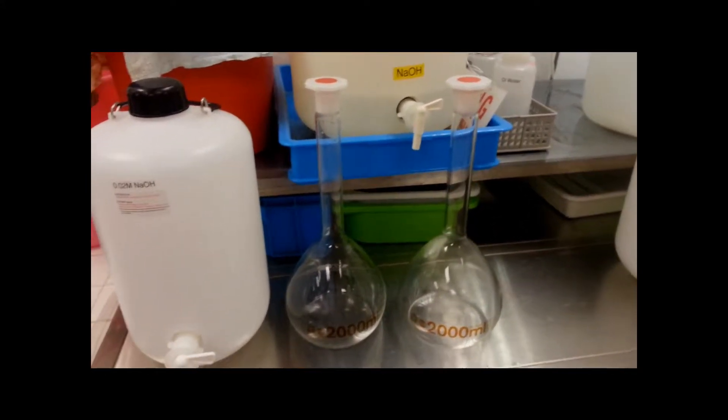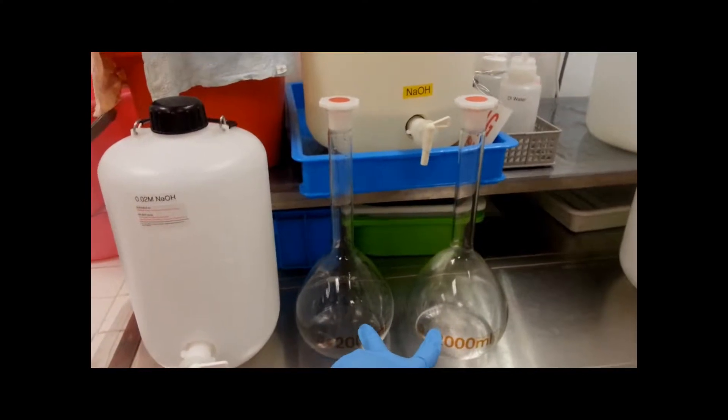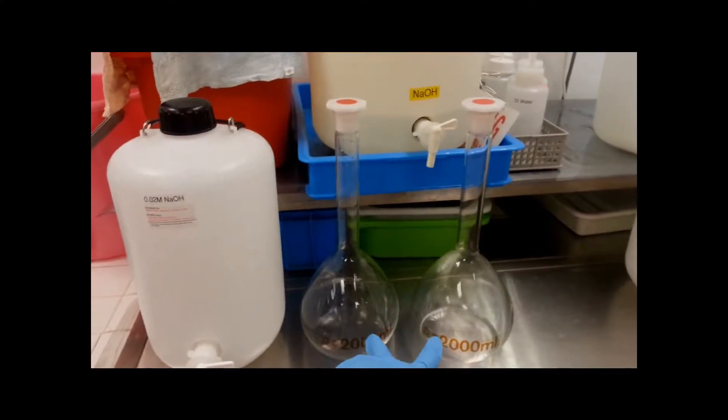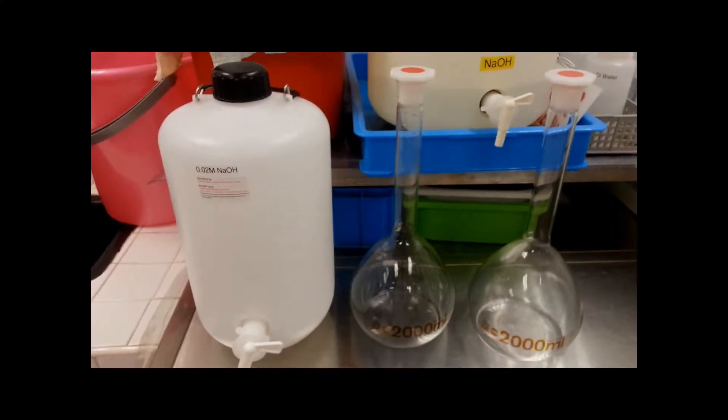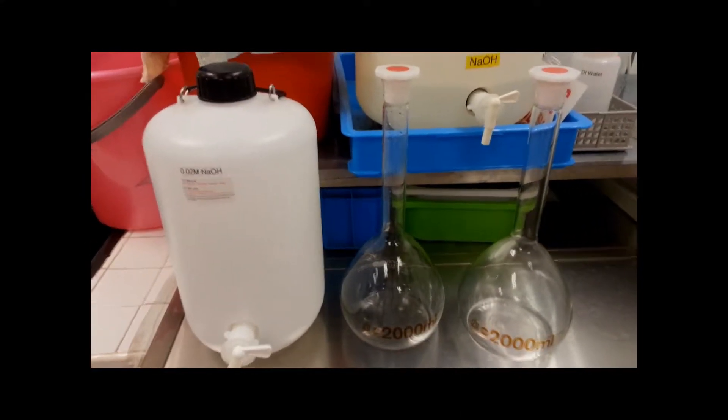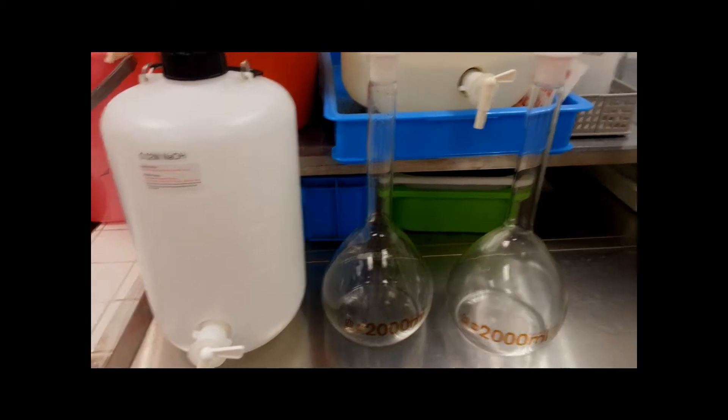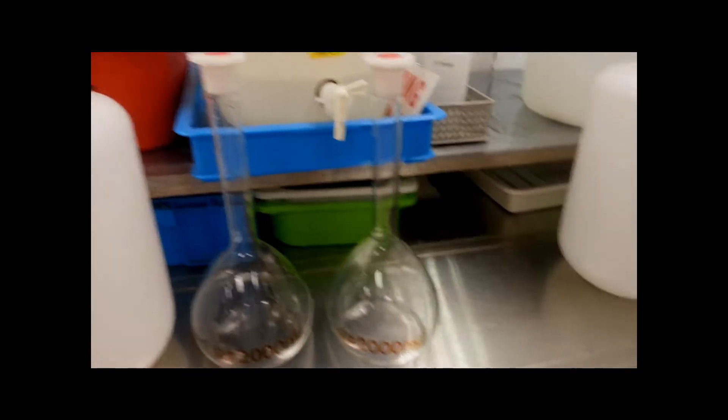To prepare 4 liters of solution, it is necessary to split it into 2 different runs. Therefore, 400 ml of 0.1 molar NaOH is added into the round bottom flask and you top it up to 2 liters using distilled water.